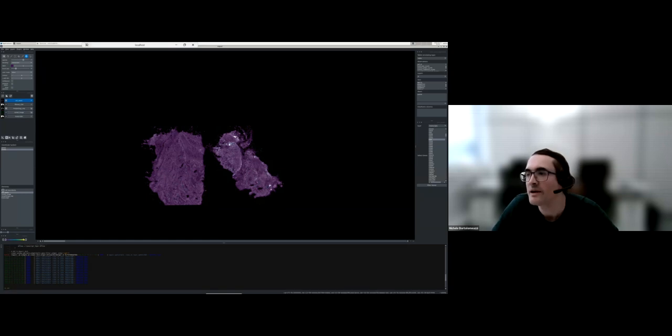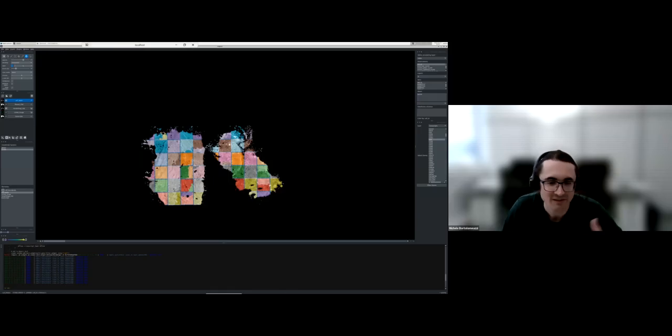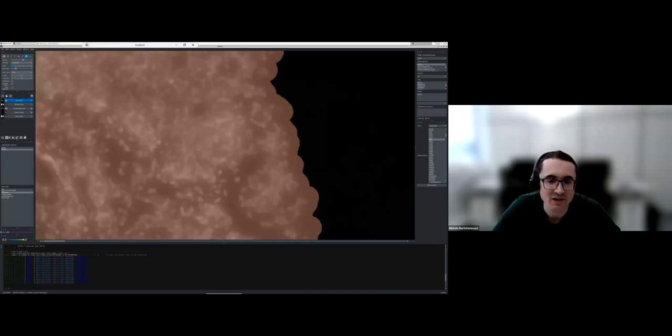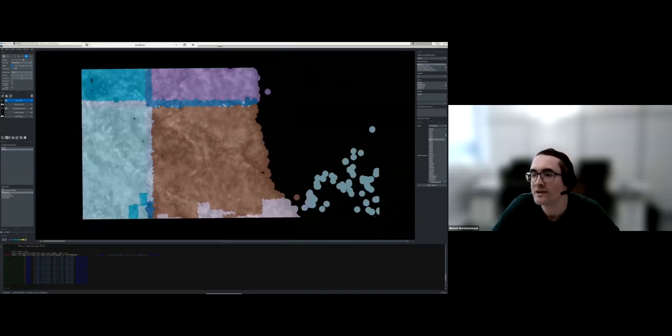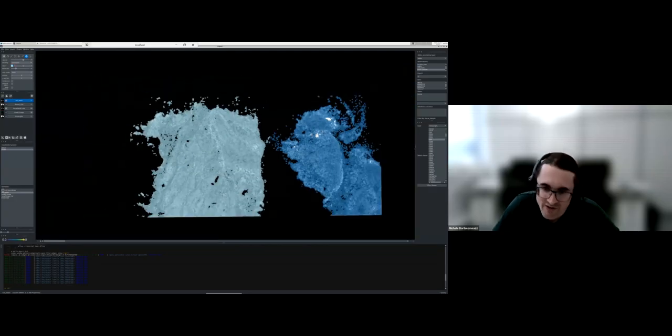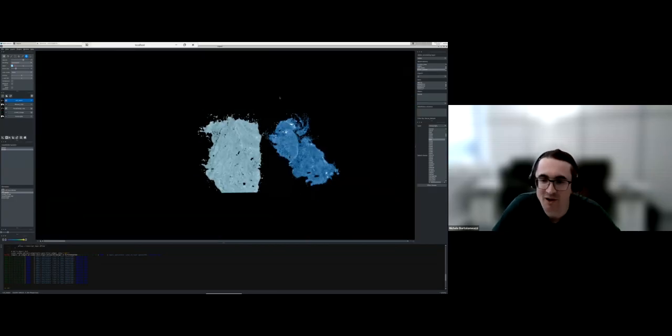Okay, so now we show it just directly by cell ID. This is just our segmentation. We can zoom in and check our nuclei, everything, but of course want to make it a bit more interesting. So here I also built a very basic annotation. I just decided that the tissue block on the left is one sample, the tissue block on the right is another sample, and I can also show it this way.